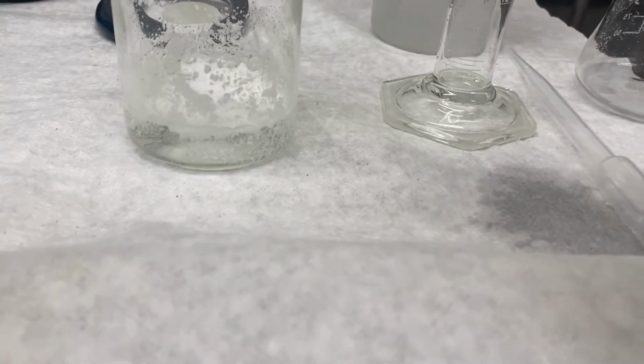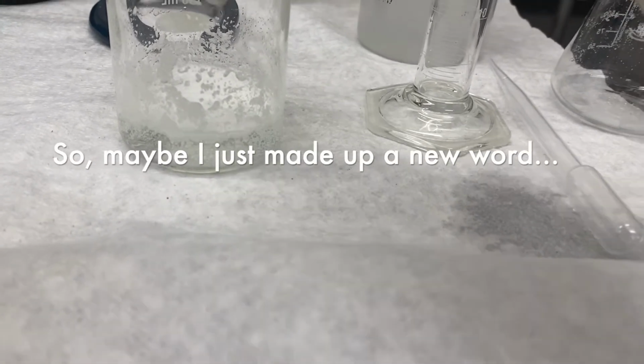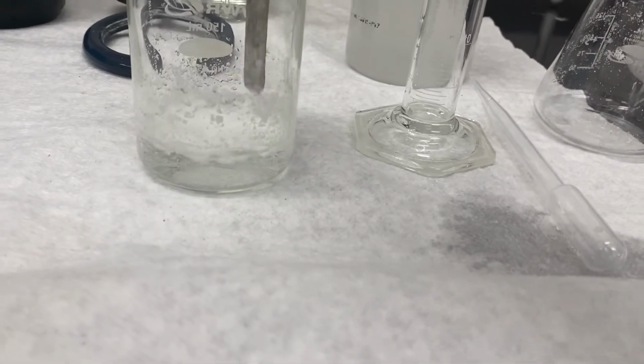But I'm just going to kind of let this settle and react a little bit. You see it's still kind of fizzing and bubbling a little bit, which means there's a bit of a reaction going on still.